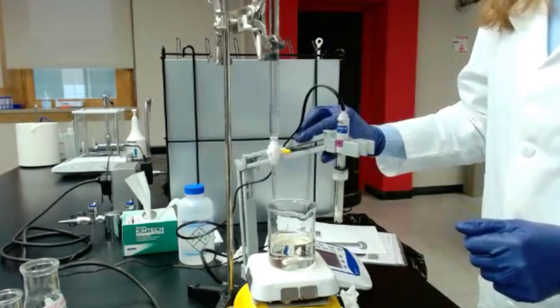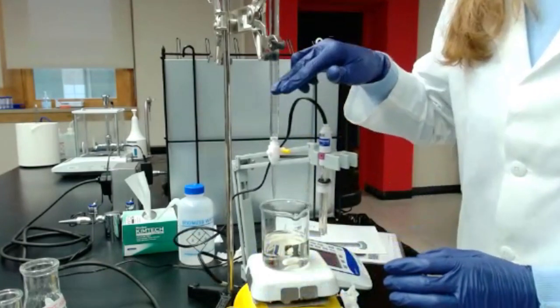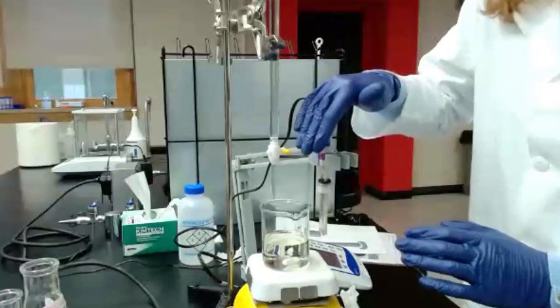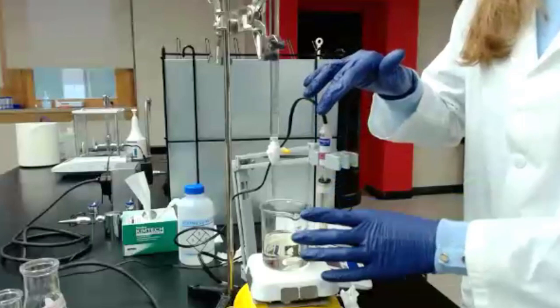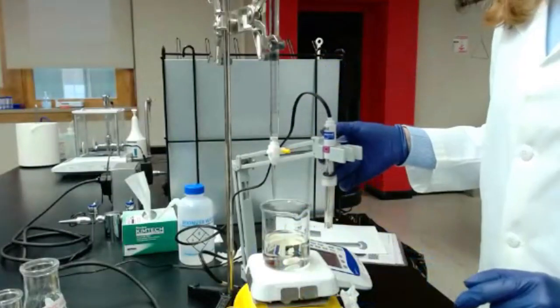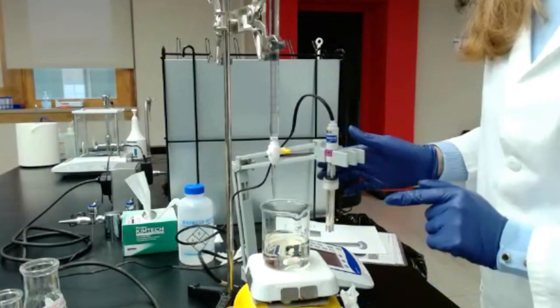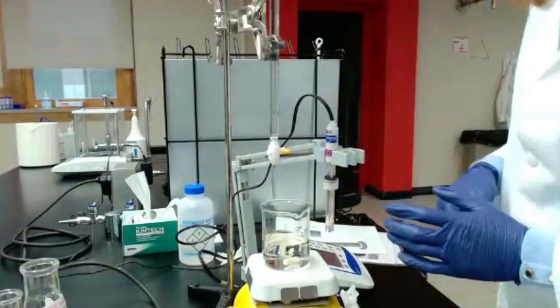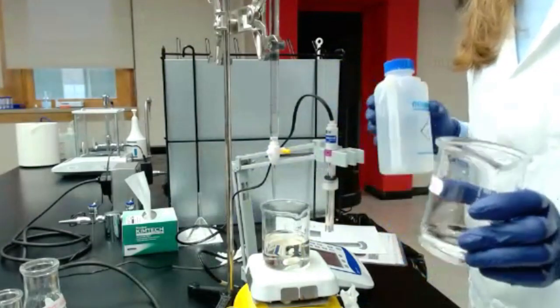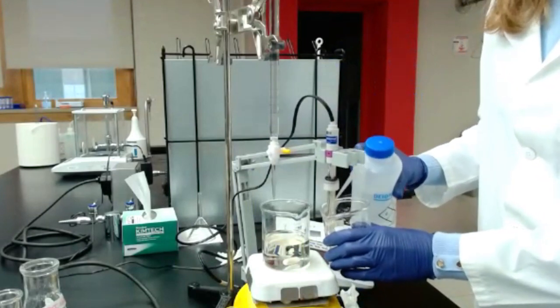So once you're done, make sure you keep something under the burette, because you still have sodium hydroxide in that burette. So make sure if it drips, you have a waste container under, or you still have your beaker under. Then you need to clean the pH probe all the time. You need to clean before putting back to storage. So same as before, you have your waste container, you have your DI water, and you rinse your pH probe.